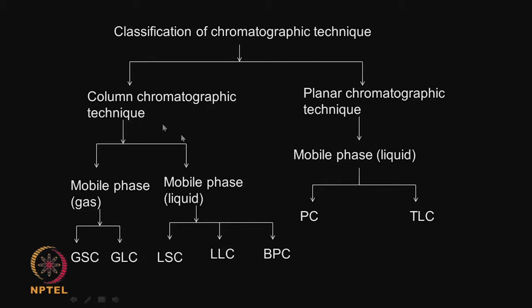Now, you must have heard about gas chromatograph. Gas chromatographs have been there for a very long time. If this mixture of solutes is vaporizable, then gas chromatograph is also a very cheap and a very powerful technique.